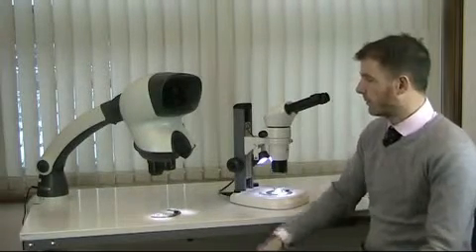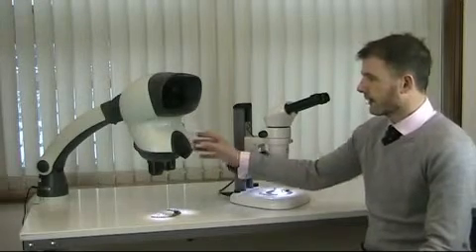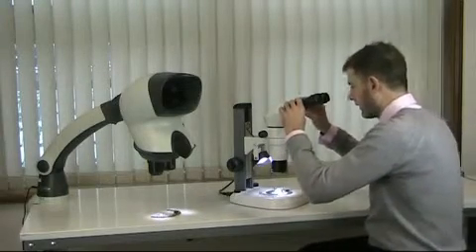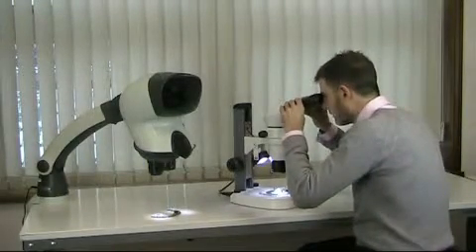But the biggest difference you'll notice is the single optical viewing lens. Now, with conventional IP stereo microscopes, the user must precisely align their eyes in order to see the subject.